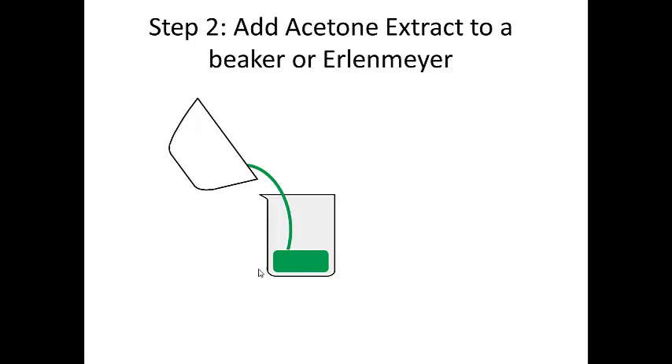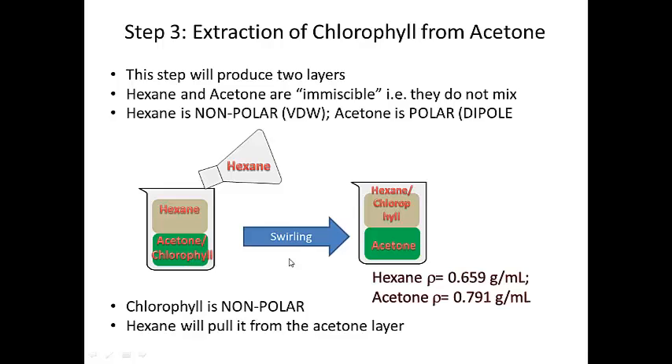Once we add the spinach extract — the acetone layer — we're going to take this layer and actually add some hexane to it. When we get to this step it's going to produce two layers: acetone on the bottom and hexane on the top.